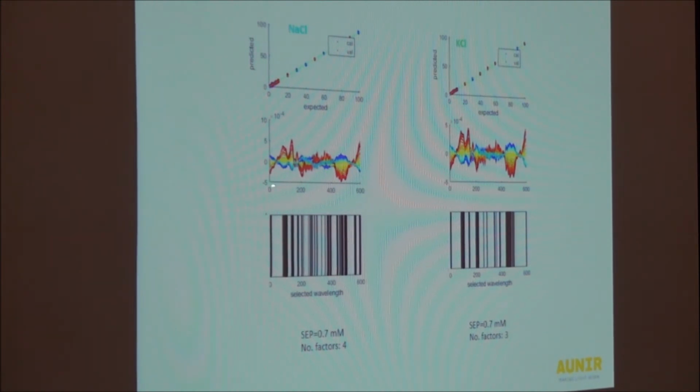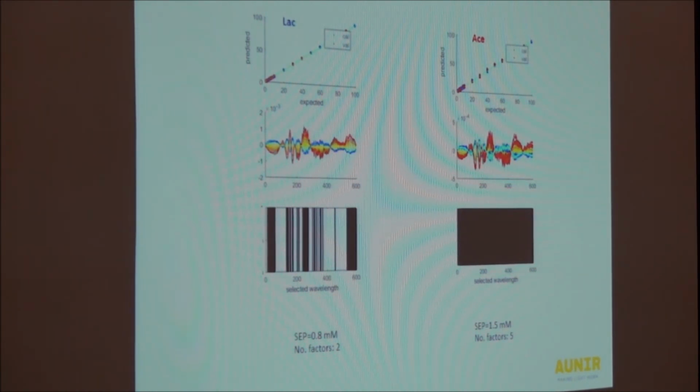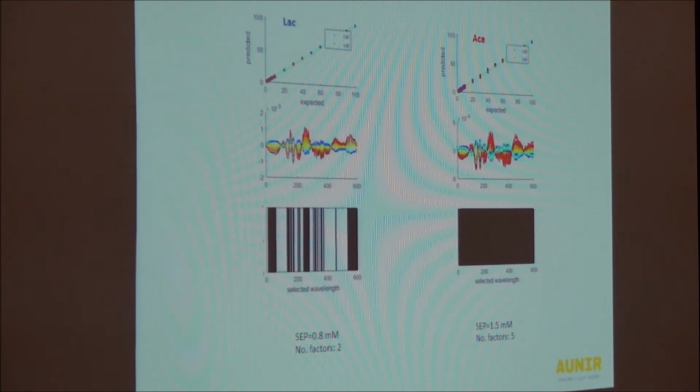NaCl and KCl. By the way, you can also see clearly the differences in absorption wavelengths for lactate versus acetate. So each one has a different imprint on the water signature. So aquaphotomics is really meaningful here. Water is capturing the information of what is in it. And we historically remove water features from data analysis because we think it's useless, but this clearly shows that water has information in it.